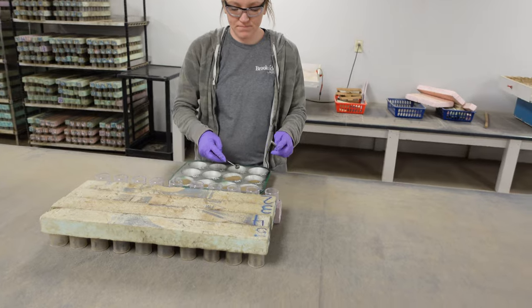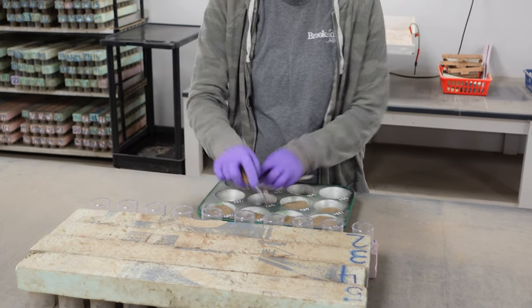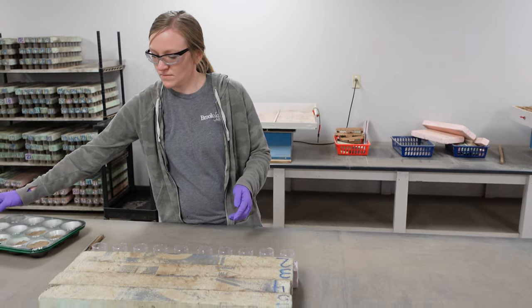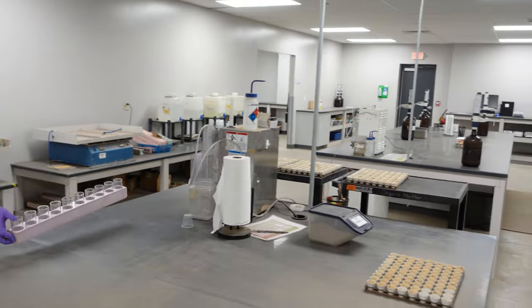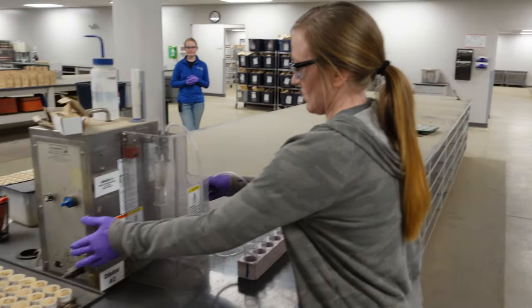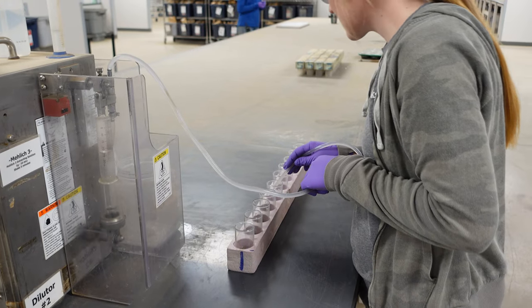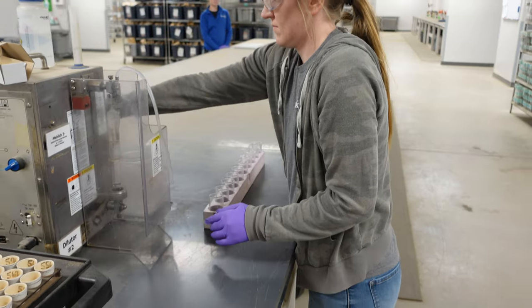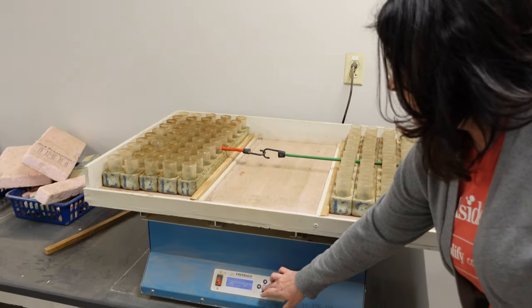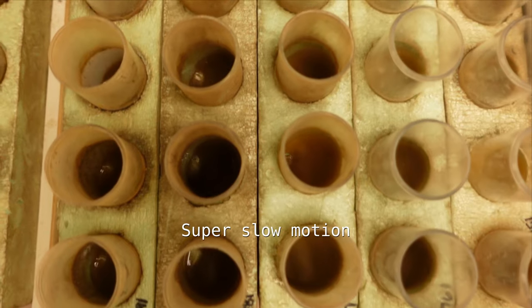This is Mehlich extraction. It's a one-gram scoop of soil placed into the designated extracting vessel. Once he has extracted around 90 samples, the Mehlich extracting solution will then be applied to the samples — 10 mLs of Mehlich extracting solution for each one gram of soil. The samples will then go on to the orbital shaker.